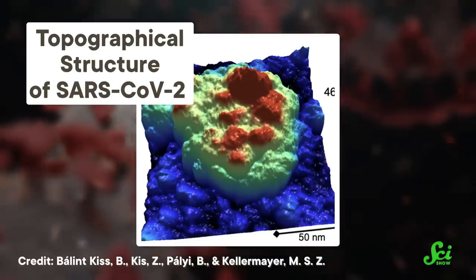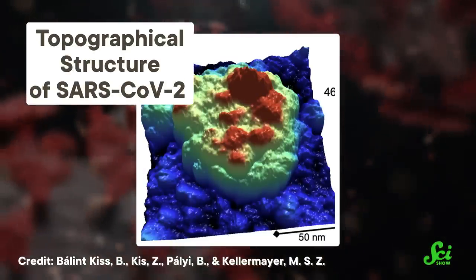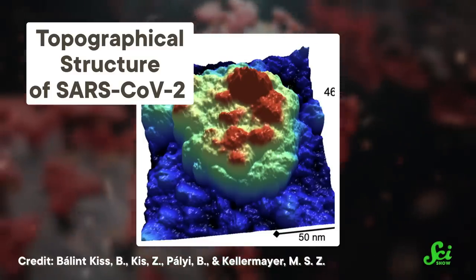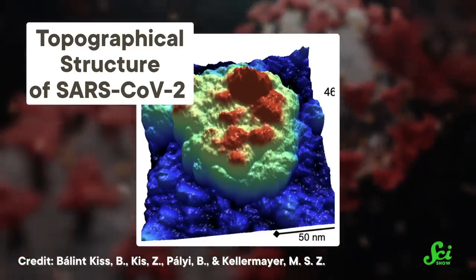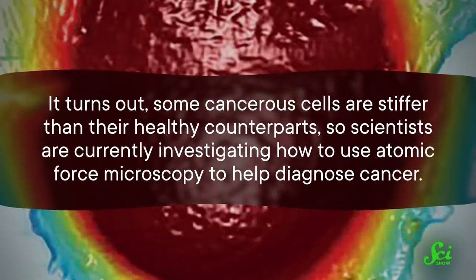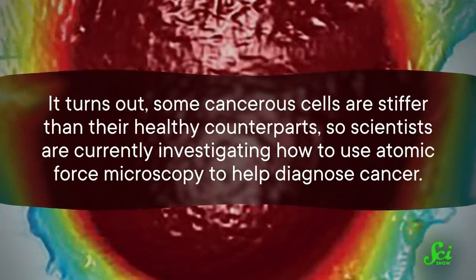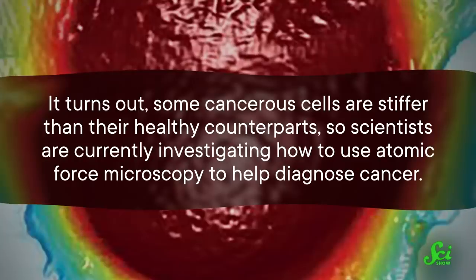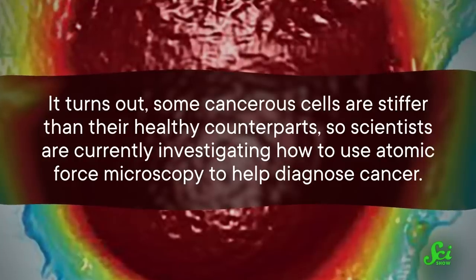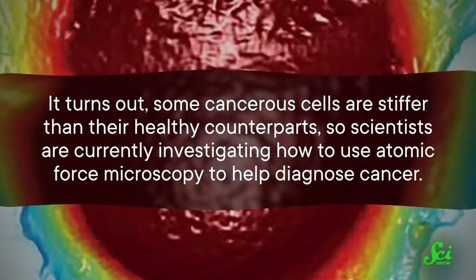By tracking all of this pushing and pulling, and how those forces affect the probe's wiggling, scientists can figure out where the tip runs into any grooves or bumps. That builds a 3D map of a sample down to the atomic level. And if you use the right kind of probe, AFMs can do more than map. They can also measure the mechanical properties of your sample, like surface friction or stiffness. It turns out some cancerous cells are stiffer than their healthy counterparts, so scientists are currently investigating how to use atomic force microscopy to help diagnose cancer, which is pretty sweet.